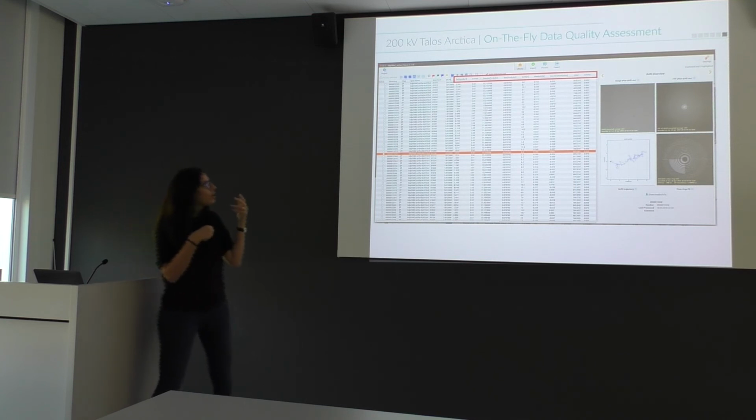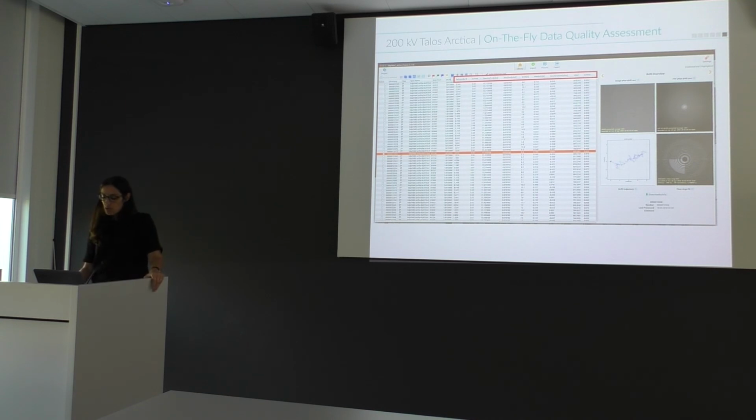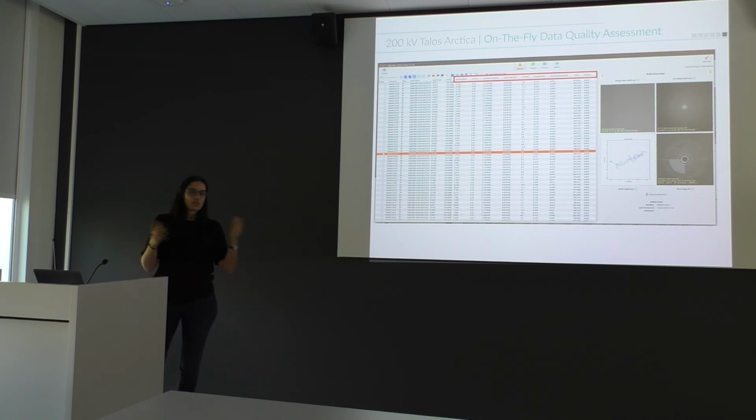And taking all of this together, for most of the projects, we really managed, in the best cases, to have just 10 or 20% at the most which we actually end up trashing. So the time that we use at the microscope is used very efficiently. Of course, this doesn't apply to all of them. Sometimes you are lazy and just let it collect, or you know it's not that good a data set, but you still want to look at it.